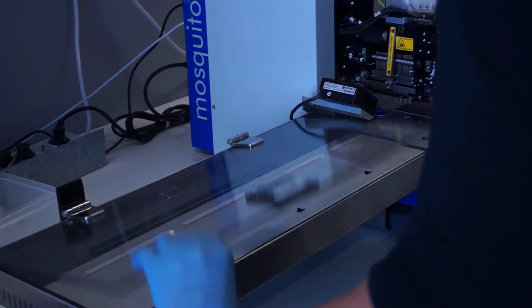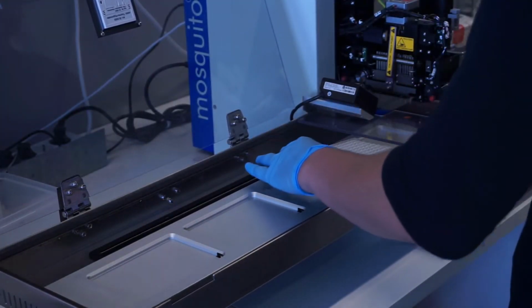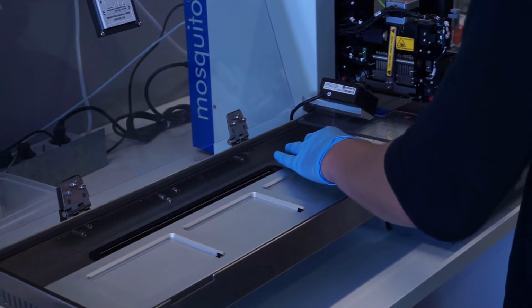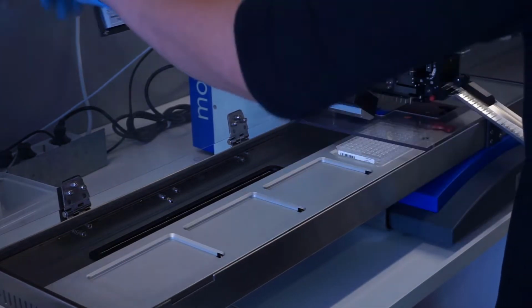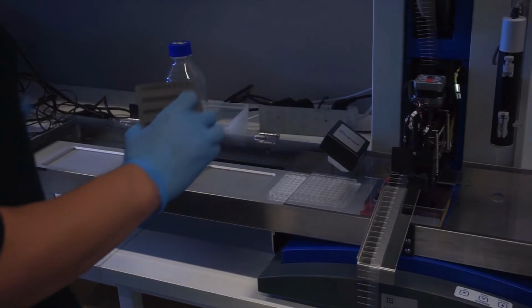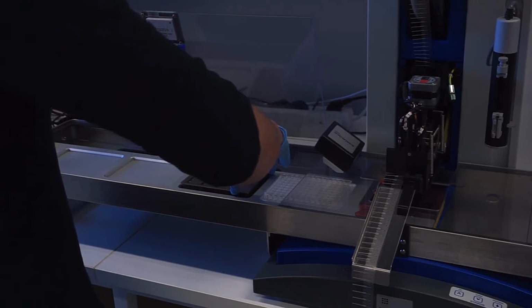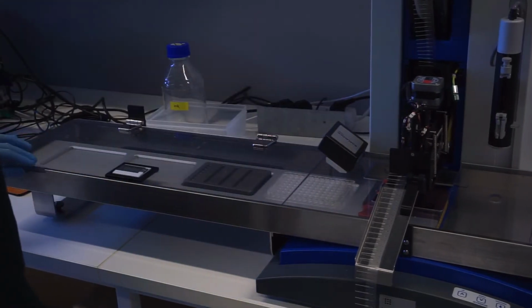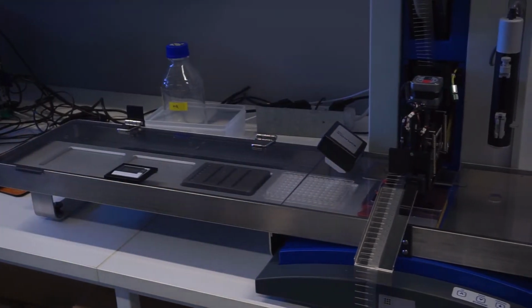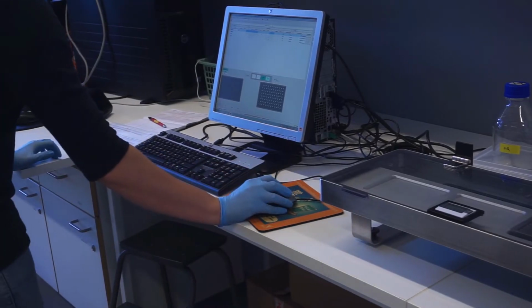Place the prepared screen in the rightmost position on the sample stage. Place the sample strip into the sample stage next to the prepared screen. Click Run to start the program.